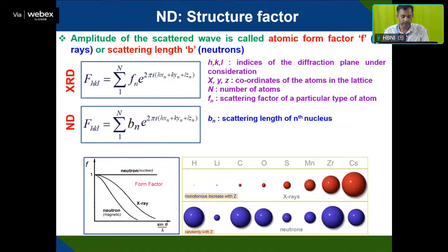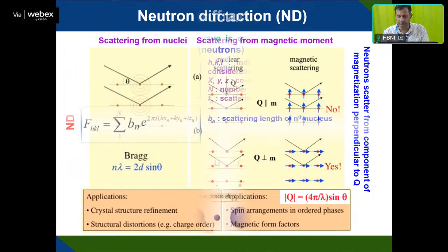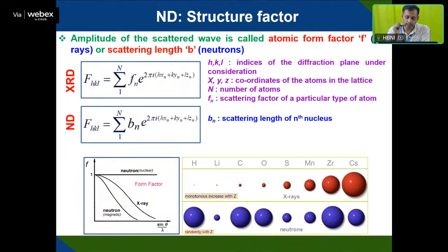because if you see the X-ray, that neutron source, from the neutron source the diffraction beam is coming out, so that we measure the intensity, and then you are able to get the diffraction pattern, which you can use to find out the structure. As I discussed in the X-ray diffraction class, in XRD you have a structure factor Fn dependent on that scattering factor here.